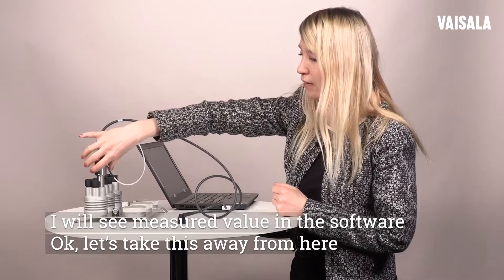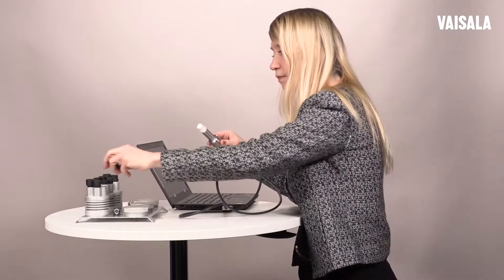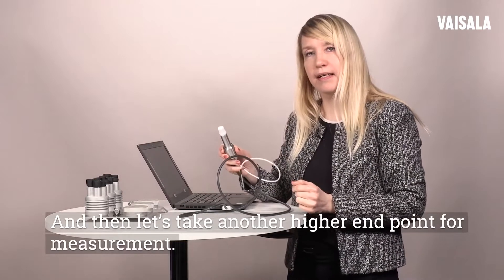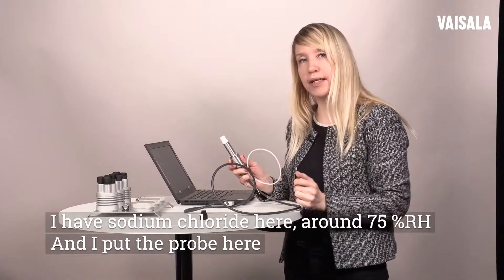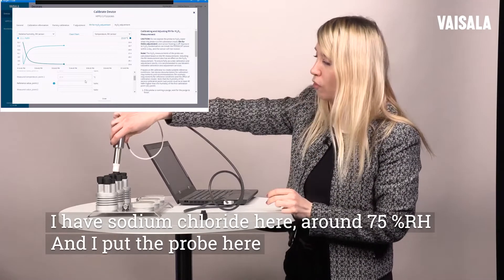Then let's take this away from here and take another higher endpoint for measurement. I have sodium chloride here, around 75 percent, and I put the probe here.